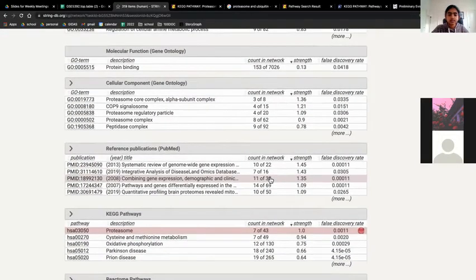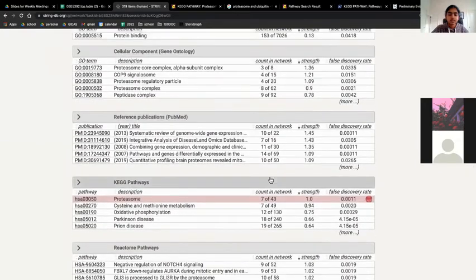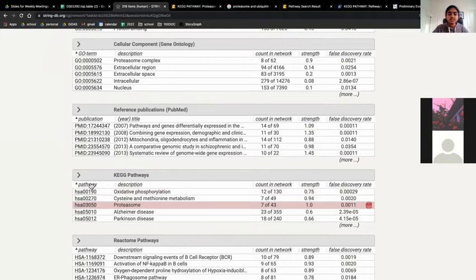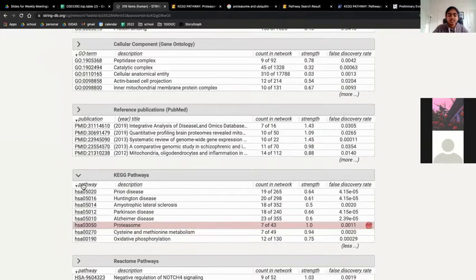Expand the KEGG, the arrow. The arrow? The arrow next to KEGG pathways on the left. Over at pathway. See how it says pathway in description? Oh my goodness. Wait, what? No, the arrow on top of that. See the arrow? Oh. Okay.